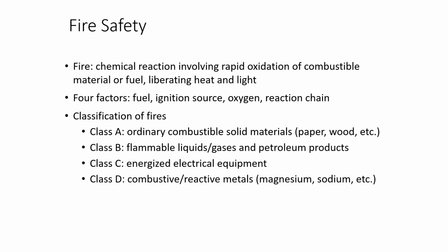Classification of fires. Class A is ordinary combustible solid material, like paper or wood. Class B, flammable liquids and gases and petroleum products. Class C, energized electrical equipment. And Class D, combustible or reactive metals, so magnesium, sodium, potassium, all those types of things.